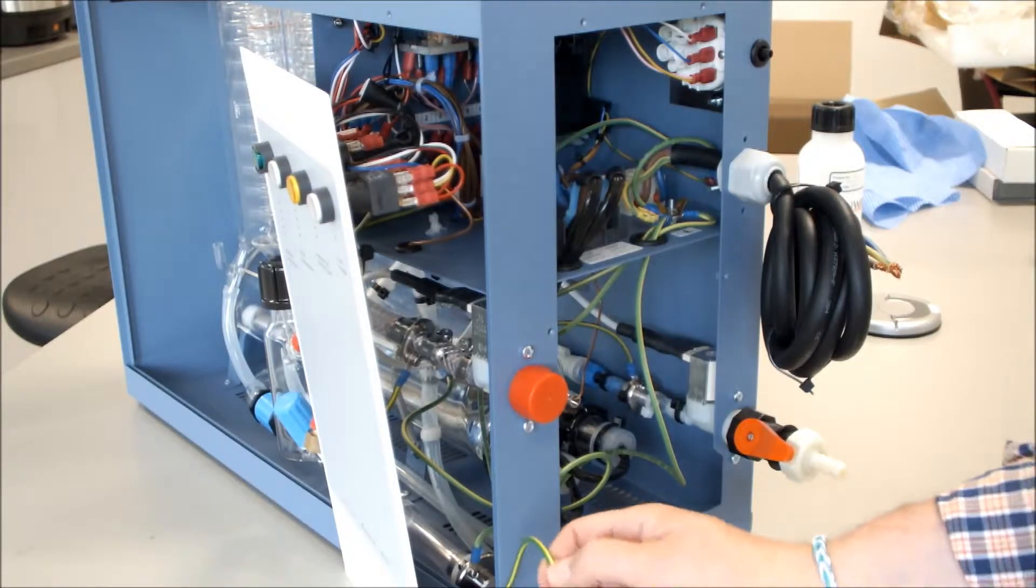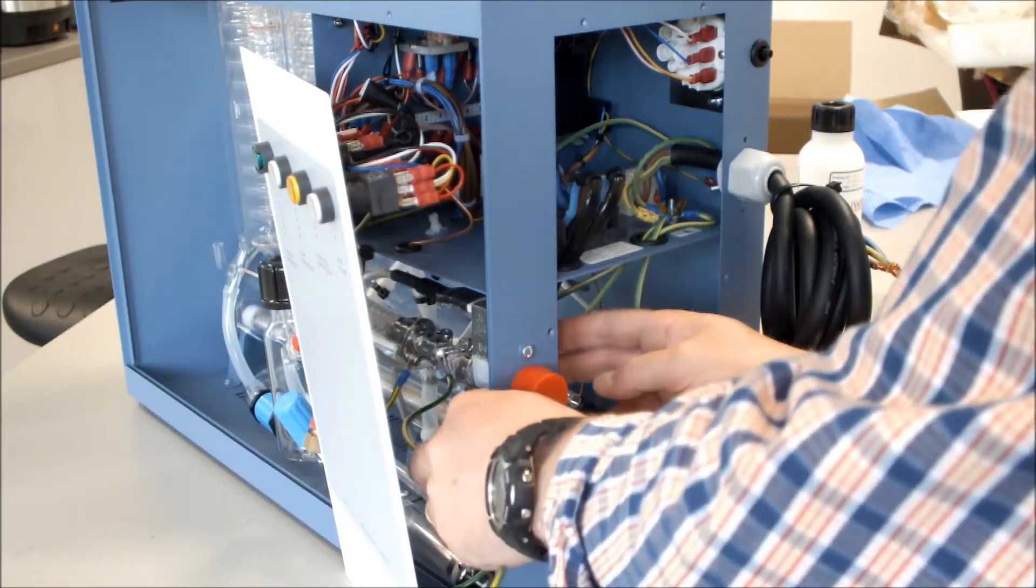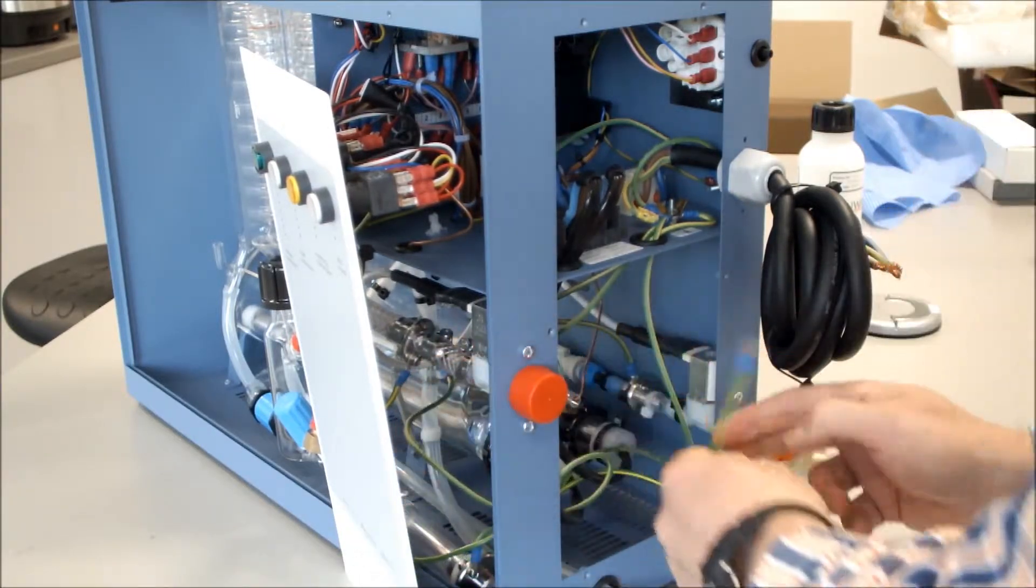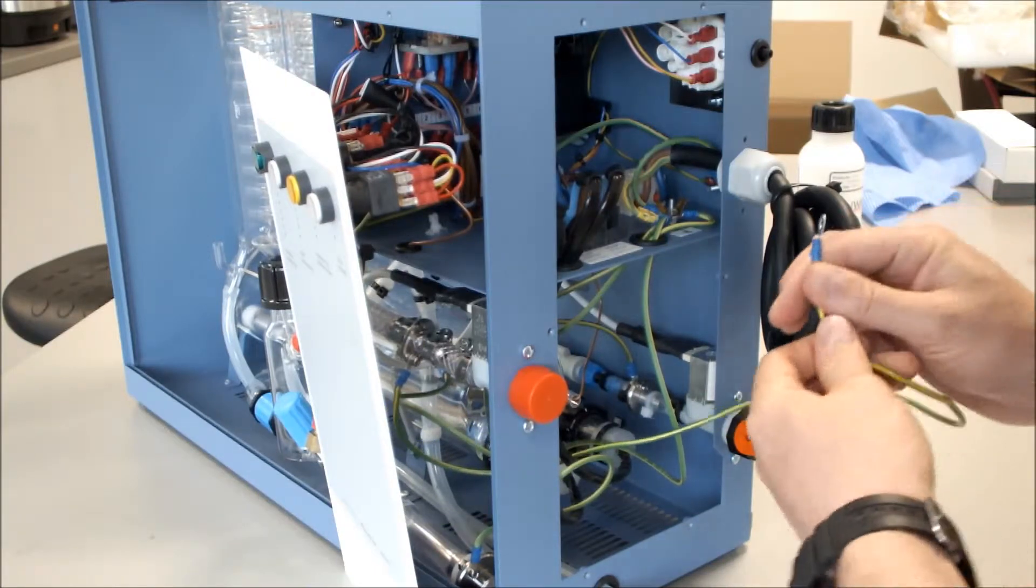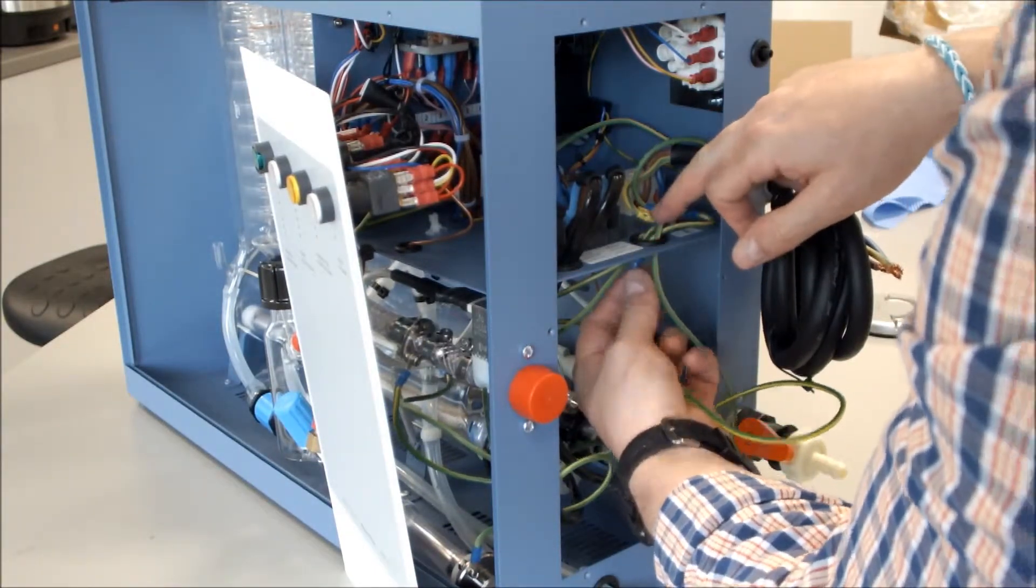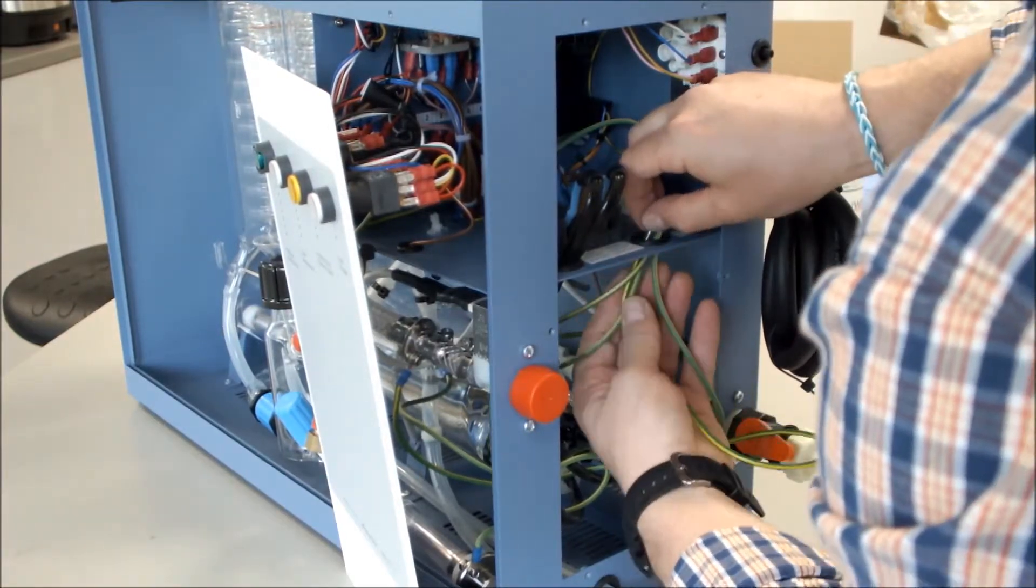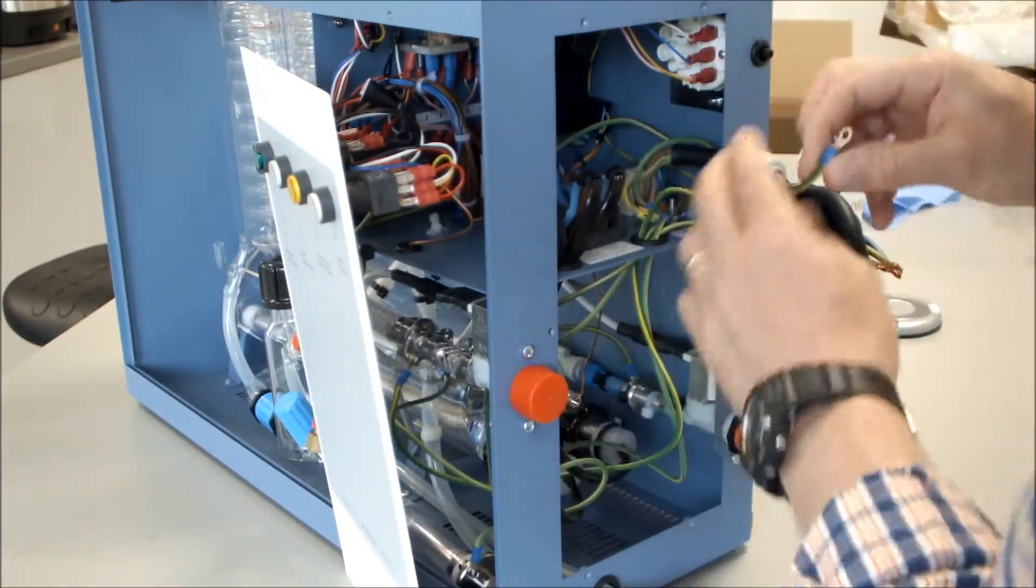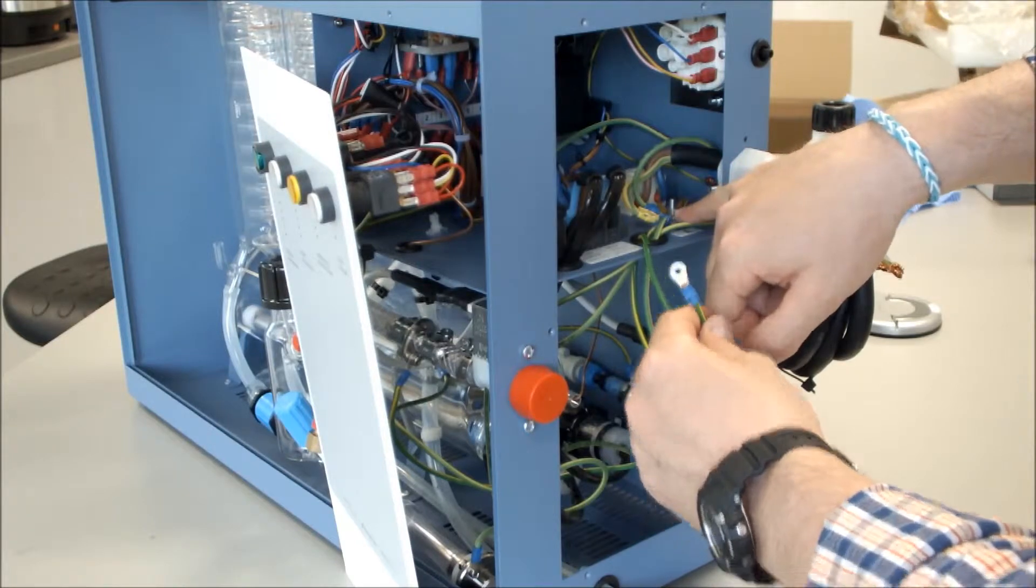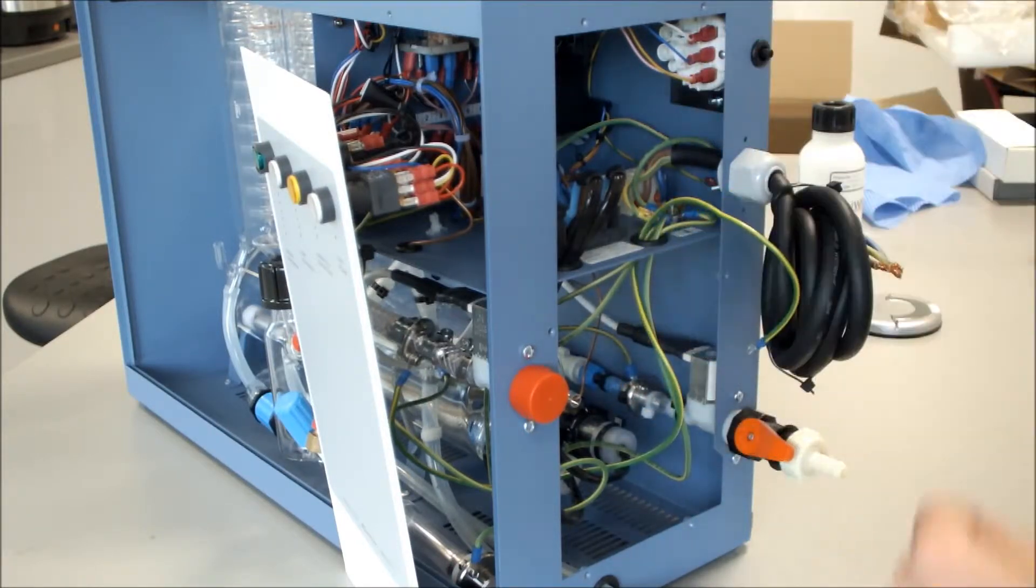When we've connected our deionised pipe, we then need to take the earth, like so, up through the hole in the chassis there. You then need to disconnect the nut on there, place that on, and tighten the nut up.